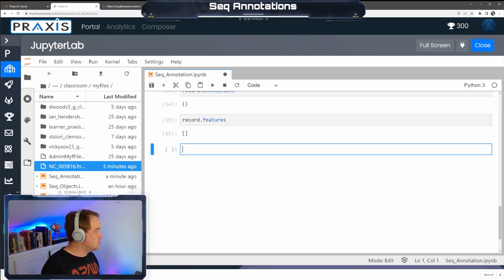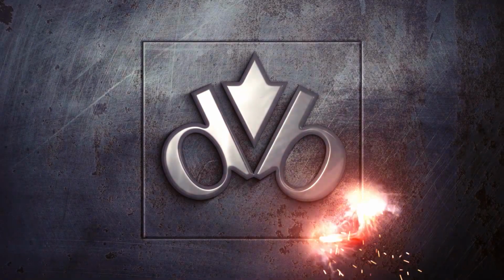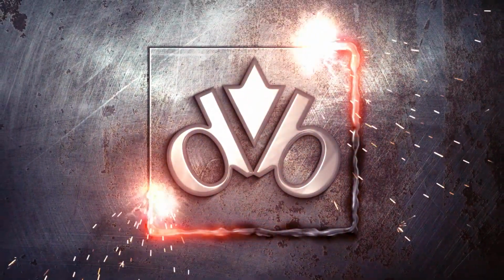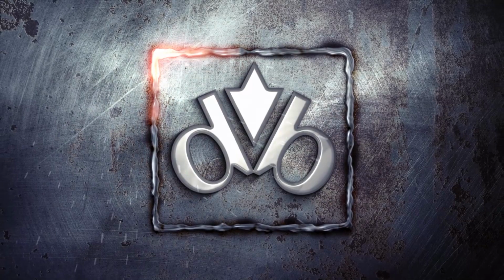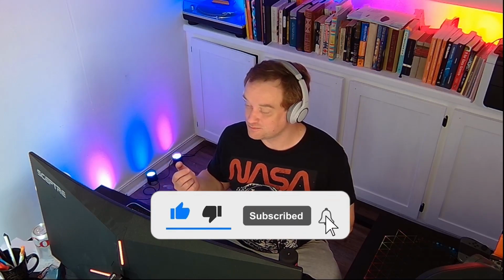Okay, so we'll stop here, and then in the next one, start working with some other file types. So that's it for the beginning of the sequence annotations. It's really nice for being able to keep track of your sequences, know what sequences are, what the descriptions are, and things like that. You can get even more detailed. We will with some EMBL or GenBank files and things like that, non-FASTA files that provide more information.